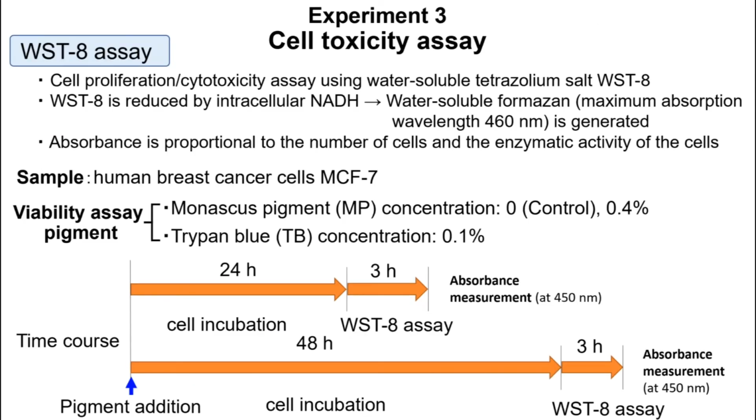Next, the WST8 assay was performed as a cell toxicity assay to confirm the non-invasiveness of monascus pigment. The water-soluble tetrazolium salt WST8 is used in cell proliferation and cytotoxicity assays.